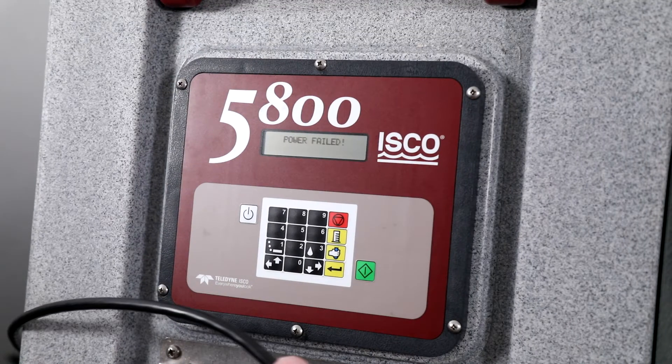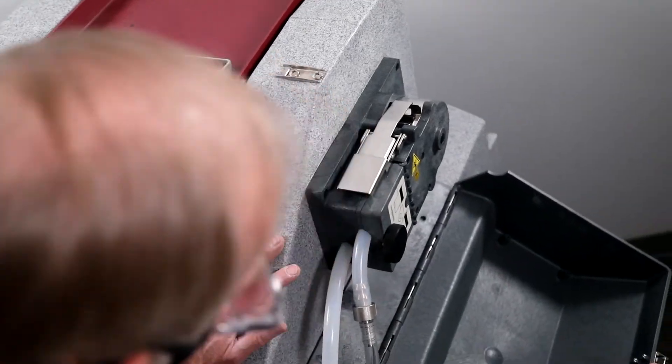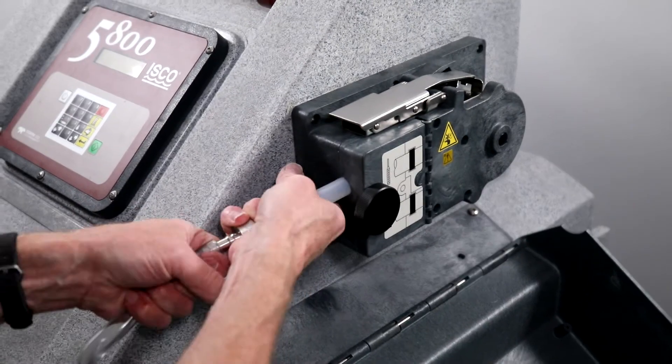Remove the power from the 5800. Unlatch the side pump cover. Remove the suction line from the tubing coupler.